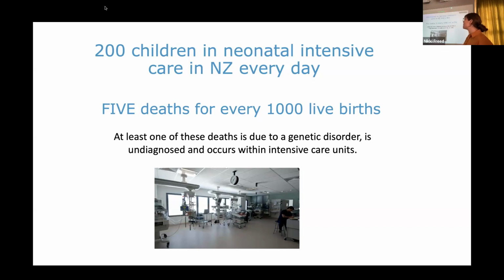So in an intensive care environment, time really matters. These decisions need to be made on the scale of minutes and hours, which is vastly different from the time scale you saw on the previous slide of months and years for a diagnosis.